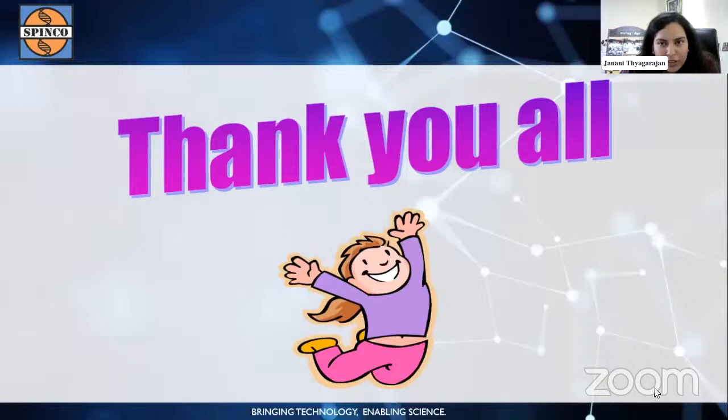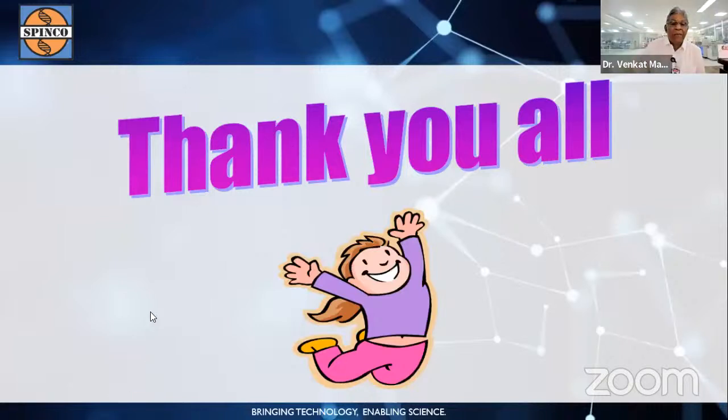Okay, so 50% of the people have gone for the M+1 ion, and we have M+1 ion and mostly adduct ions at 29%, and molecular ion only at 16%. And 4% of the people have answered the adduct ions of the molecule. Sir? Sir, you're muted. Yeah, M+1 ion and mostly adduct ions would form in the electrospray ionization technique.